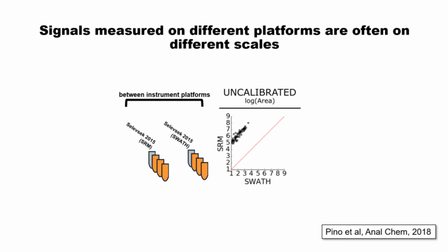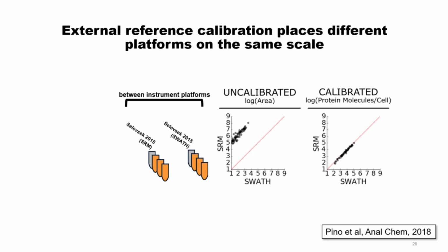So the first thing that we did is we took their data, and in there they actually had SRM data to validate some of their SWATH data. And they actually said the triple quad data doesn't give the same signal as that of their QTOF. And you can see their SRM peak areas are fairly correlated, but they're not very well calibrated with one another. If we express them all relative to their reference that was measured and prepped and measured within the same batch, and actually has a value associated with it, as in copies per cell, their actual data is extremely well calibrated. So in their paper, they made a case saying that they can't compare their SRM data directly to their SWATH data because it's poorly calibrated.